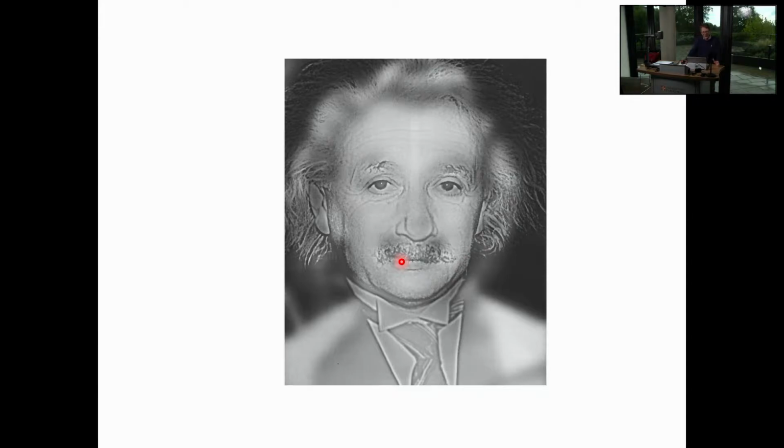Another way that this happens in the microscope, if your sample is sufficiently small, this happens automatically. So you can see the spatial frequency information has now disappeared, and you get on your screen only what passes in the spatial frequency window that is actually transmitted.